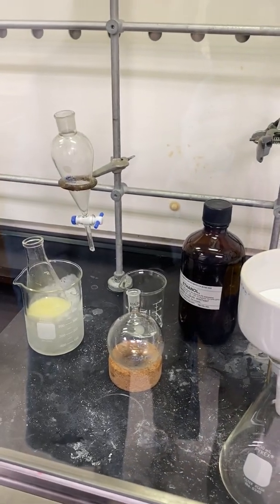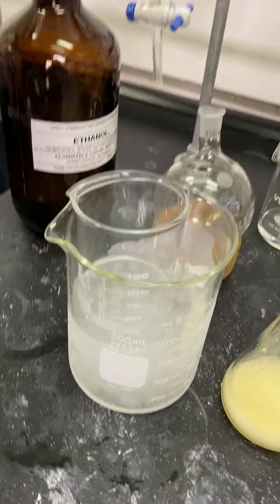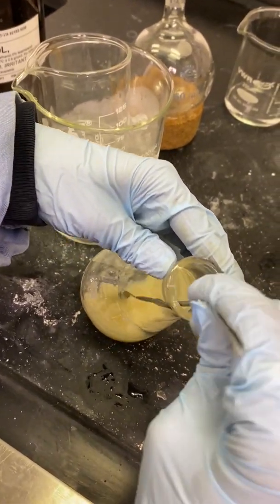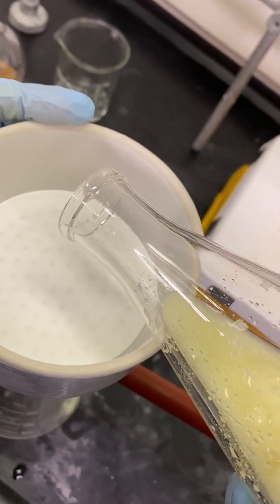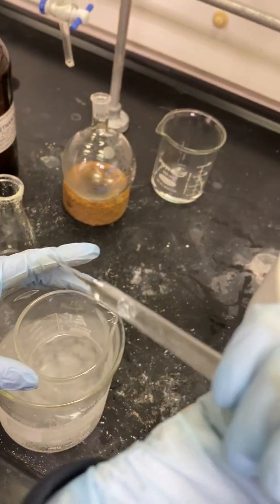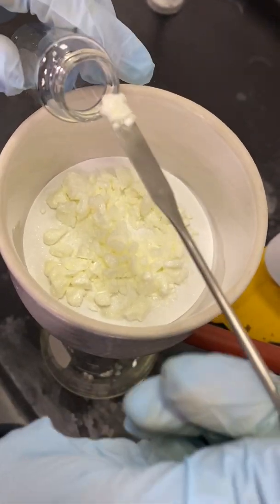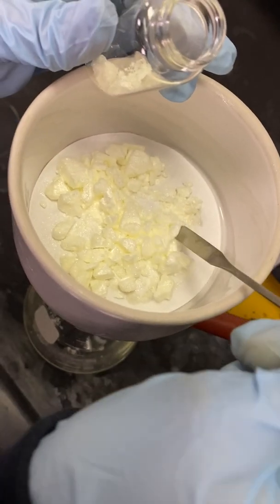I have now set up a vacuum filter to filter off the ethanol from my product — you should know how to set one up from the Grignard lab. I have placed some ethanol into a beaker in the ice bath to cool it before rinsing my product. Once a good amount of product has formed, I will use a spatula to scrape the product off the sides of the Erlenmeyer flask and carefully pour my product onto the filter paper. Using a Pasteur pipette, I will add ice-cold ethanol to the product on the filter paper to further purify it. After the product dries on the vacuum, I will carefully transfer my purified product with the spatula into a pre-weighed scintillation vial. Please weigh your scintillation vial again to get the percent yield and also take an NMR of your product.